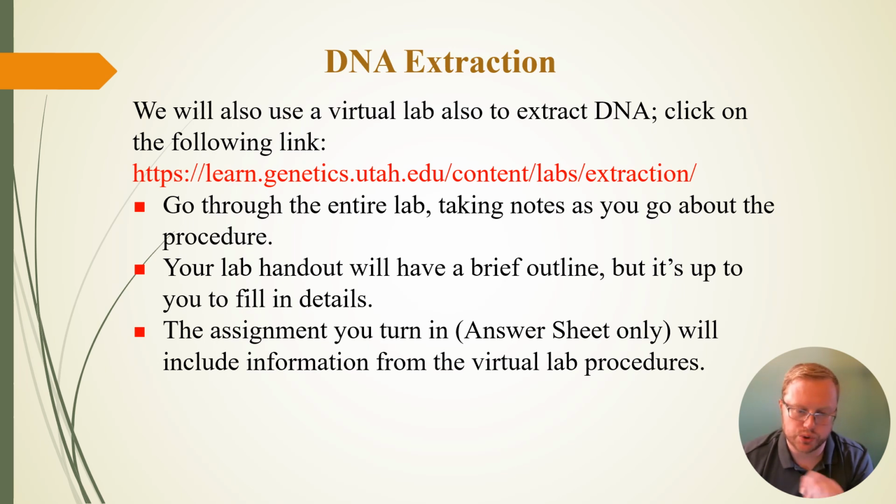There's also a virtual lab available. If you do the physical lab to extract the DNA, you should be fine. You should be able to answer the questions with that. Now, if Dr. Todd has you click on this link, great. If not, I'm going to consider it to be optional. So click on this link if you want to use the extraction, but the directions on the previous slide should be sufficient for what we're doing today.